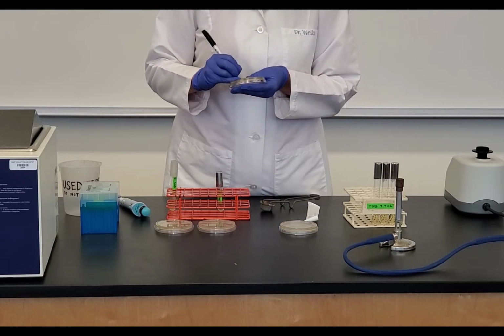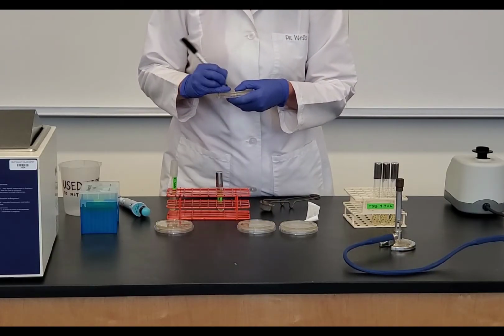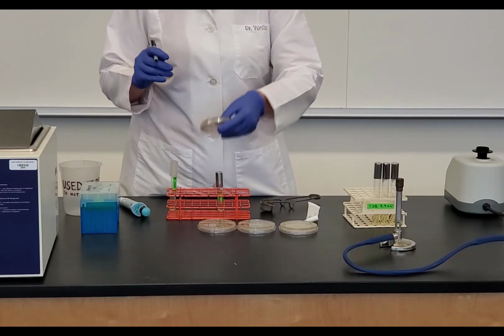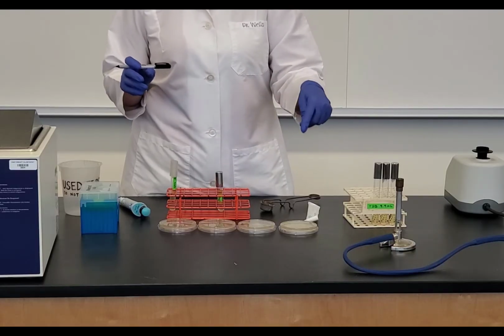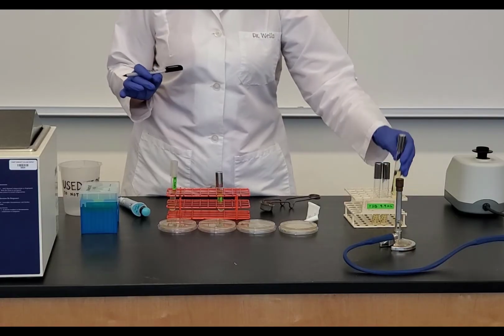This is my 10 to the negative 5. I'm going to label this one 10 to the negative 6 and 10 to the negative 7. And then I would label those completely with my name, lab day and section, and the date on all 4 plates. But for the sake of time, I'm not going to do that.